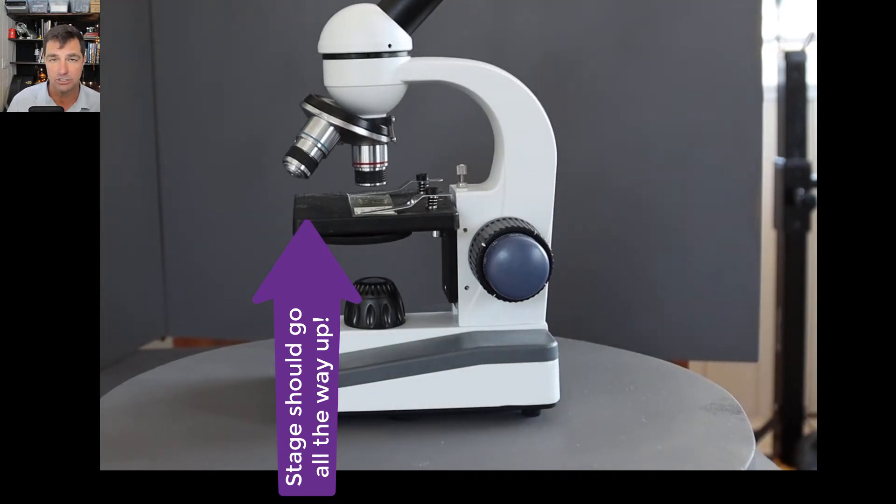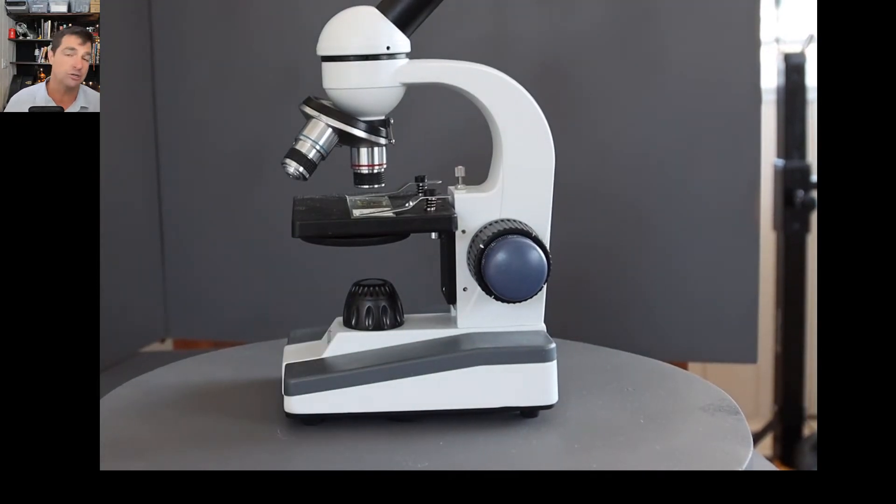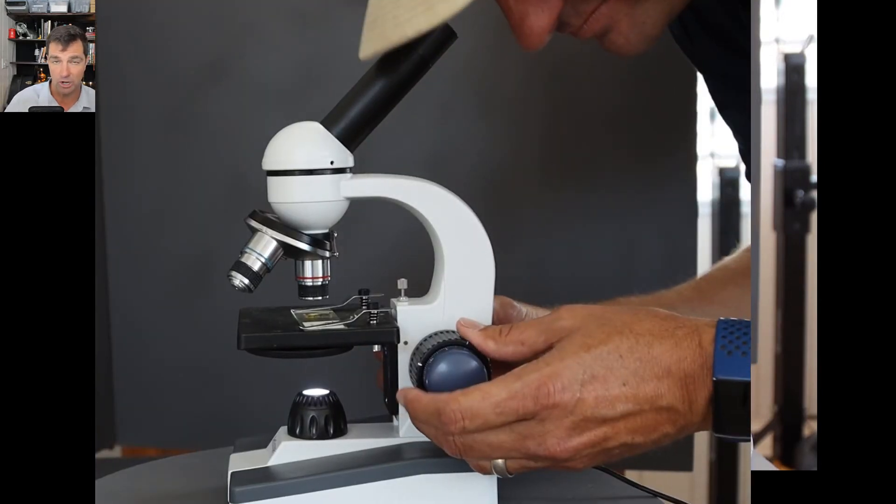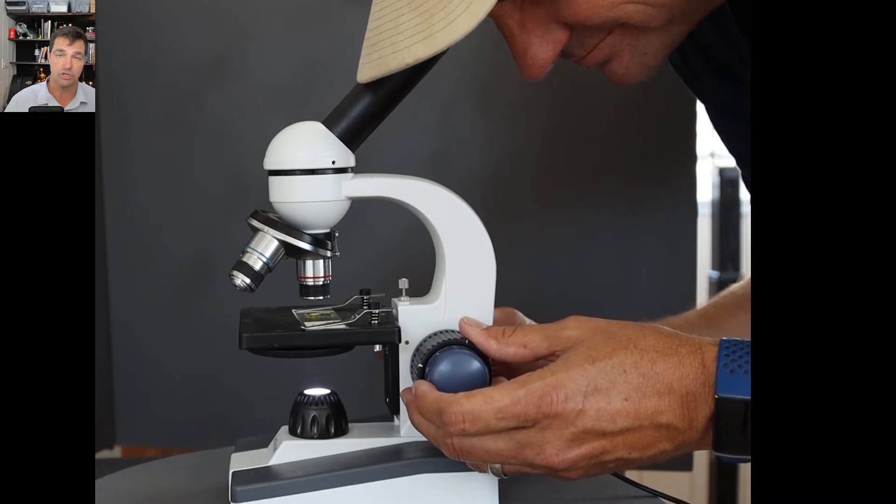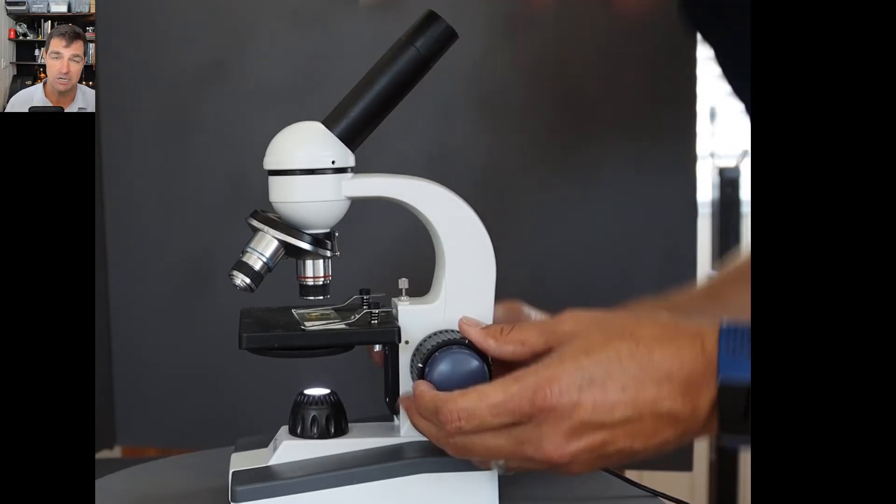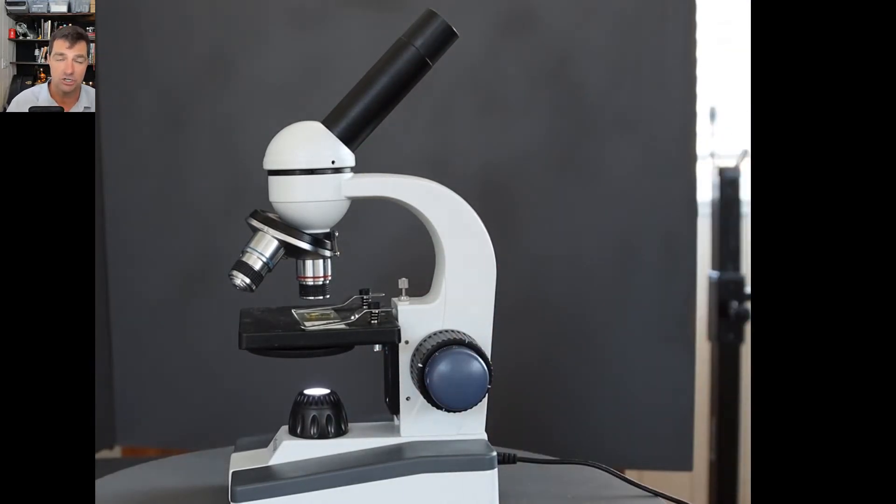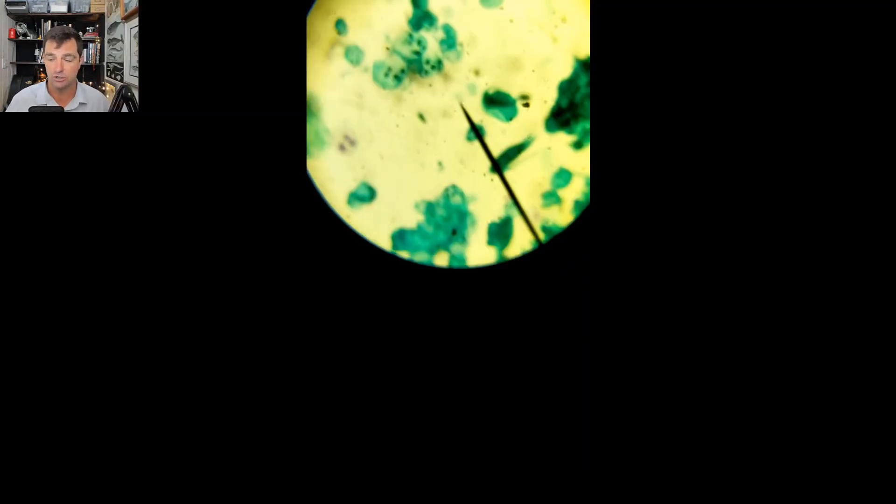Then while you look through the microscope, you'll find you can only turn the course adjustment knob one way, which will move the stage down. Turn that course adjustment knob slowly, and what you're looking at should come into focus.